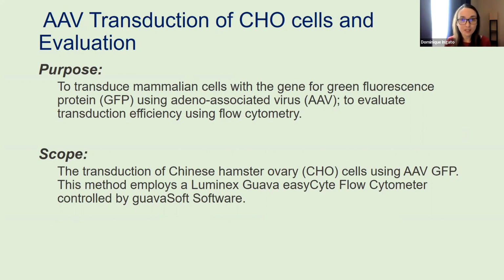In talking with our industry partners, we found that a lot of them were really excited about the idea of students coming in with flow cytometry knowledge, because it is a bit challenging to find candidates who have that experience, and it is something that's used frequently in gene and cell therapy. These companies included Kite Pharma and ViaCyte, as well as others who are really excited about having students be able to do flow cytometry.